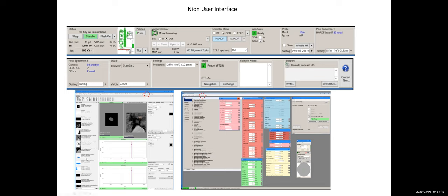The major issue of this software is it does not give you a very good automatic naming convention. So you need to always define a clear name for the data you care about. For example, you can take your notes on your notebook, what is 003, and type in 003 in this Nion Swift. So you can match the experimental condition and the name in the Swift.